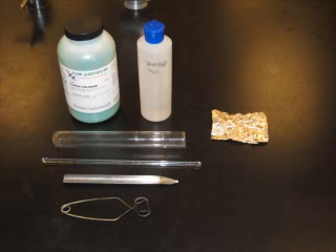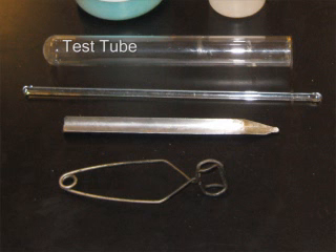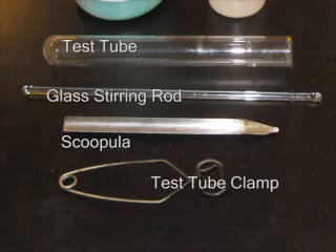These are our materials: copper chloride, distilled water, aluminum foil, test tube, glass stirring rod, scoop, and test tube clip.